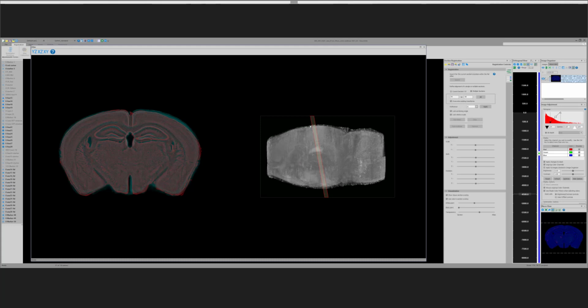One of the major things it does is make adjustments in the y-axis, because when we generate this whole brain volume, it's difficult to get the sections aligned perfectly in the y-axis. You can see in the normal brain there's some curvature to that. With BrainMaker, sometimes it flattens that out. So this is one of the things that it does.